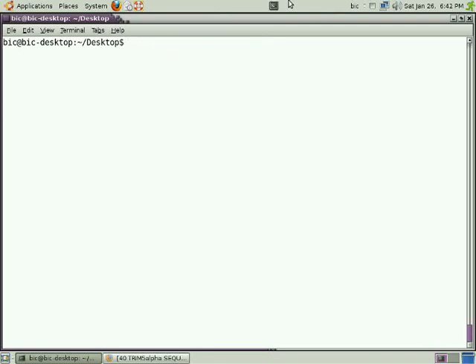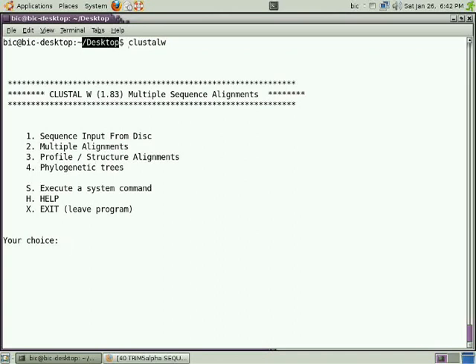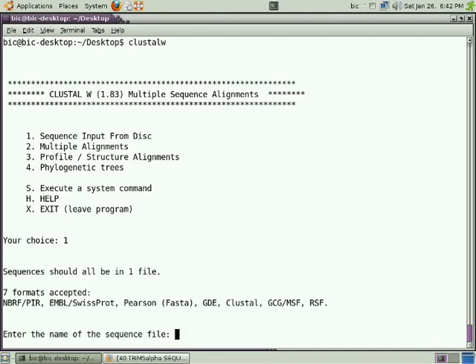Now I have ClustalW version 1.83, and it's simple to use. I will explain step by step. The first thing is to input the sequence from the disk. One thing you should remember: if you are inputting the sequence from the disk, you should be in the particular folder. For sequence input from disk, first press number 1 to get the sequence from the disk, then enter the name of the file.